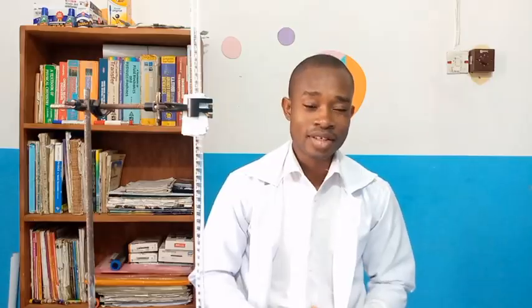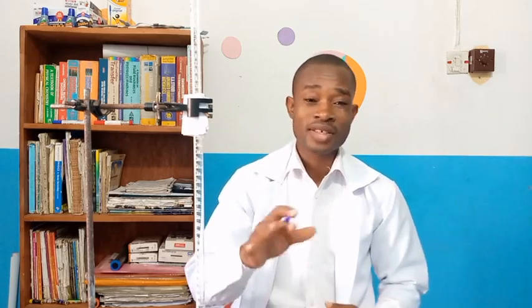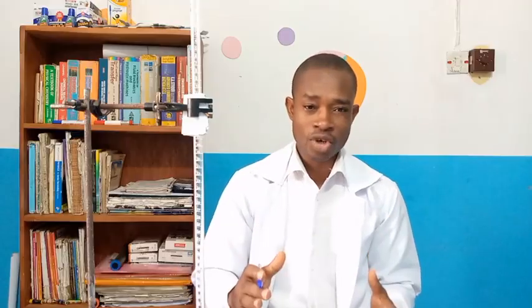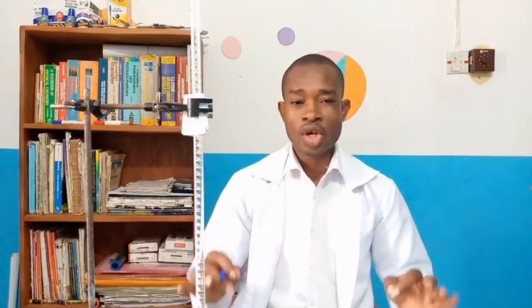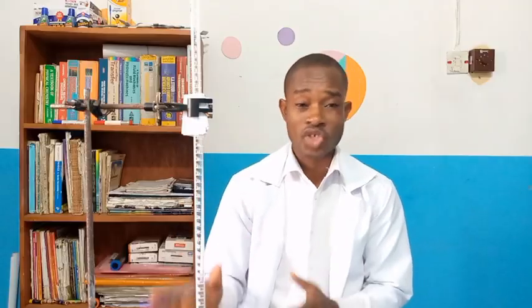The reason being that when a student sits for a titration experiment, let us assume that it is an alternative to practical, it's possible for an examiner to decide to give you an incomplete table of values for the volume of the acid used, in our case, the volume of potassium manganate 7.